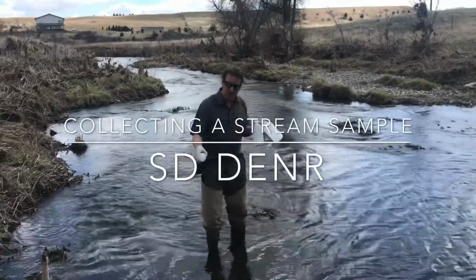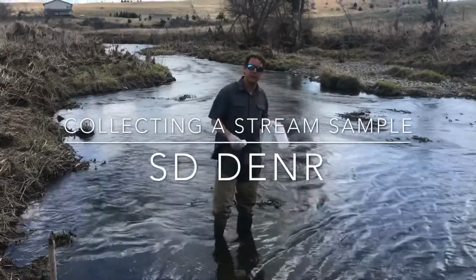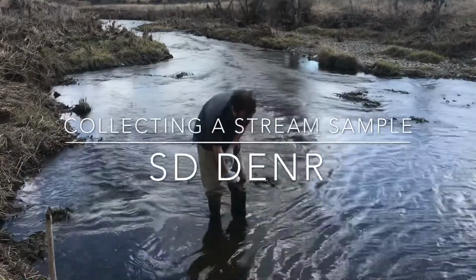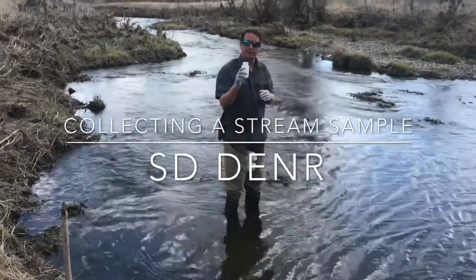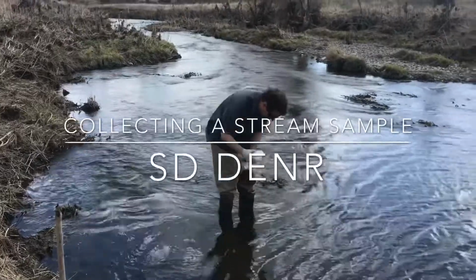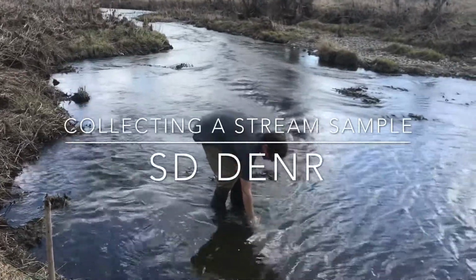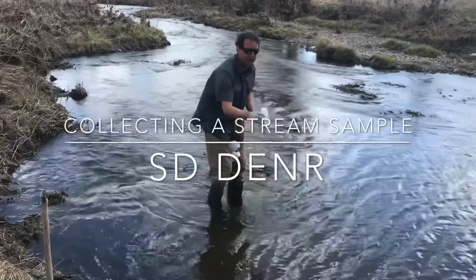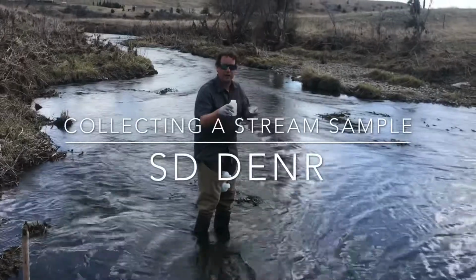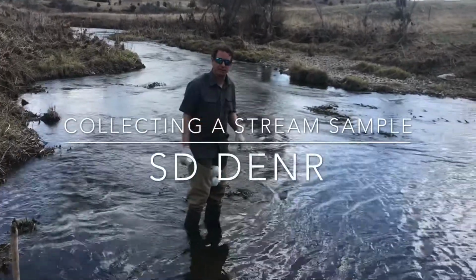I'm going to stay a little close to shore to collect the sample. Normally I'd go more in the middle, but I'm just going to do this example right here so the camera can hear me. And we always do our C bottle first, and we do not rinse it. So you take the lid off and break that seal. Put the bottle in the water upside down, get it about a half a foot to a foot under, invert it, let it fill up, and lift it out. Shake off a little bit of the excess, cap it, and that's it. That's your C bottle.